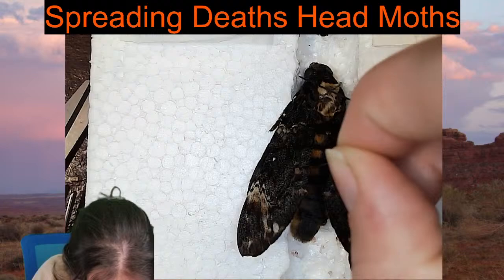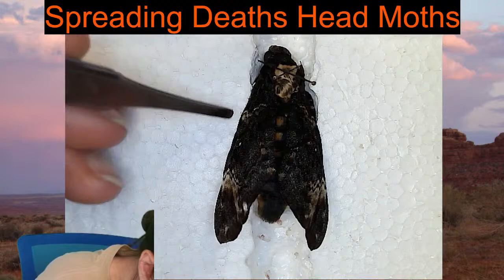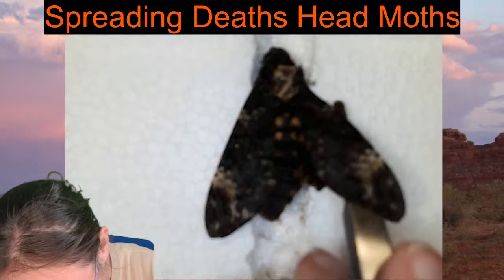Our specimen, when the body went down into the channel, the wings actually came and opened up for us. Thank you, wings. Here we go. Make sure that these can get over that edge. Perfect.